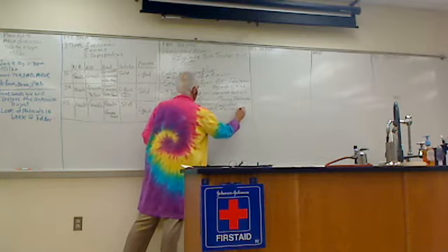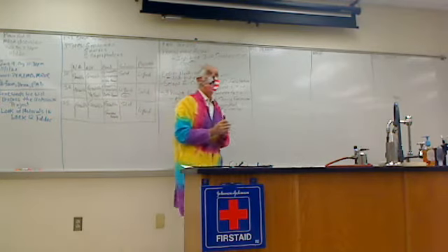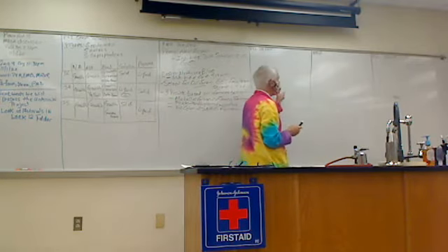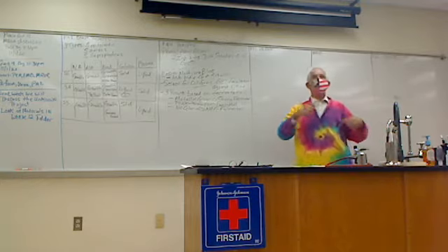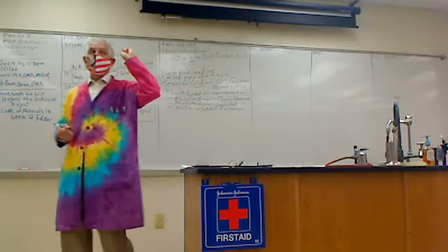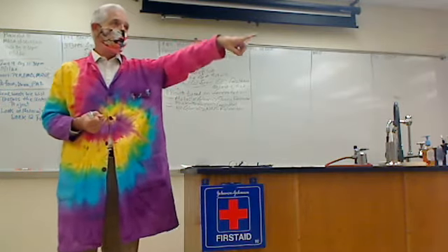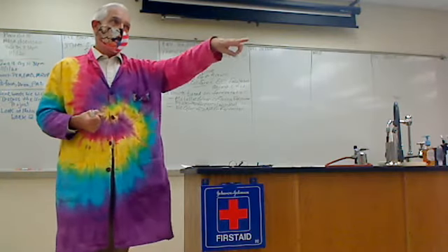Okay, so here's what we're going to do. For all of these guys today, I'm going to ask you, please, we've been saying all semester you have to label, right? So your initials should be on there. Each of you has a different type of bacteria, so again, you guys are going to be setting up the plates. Okay?